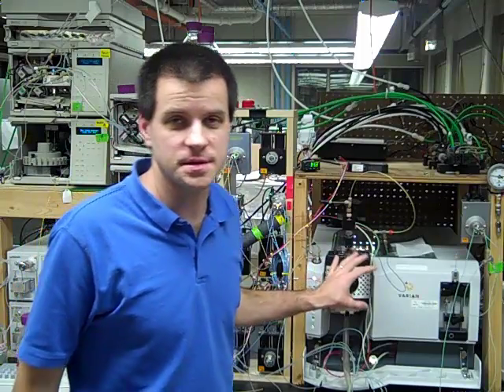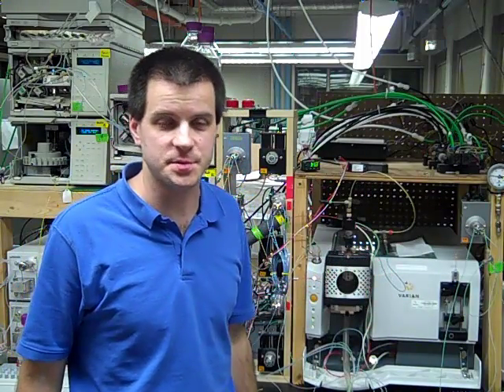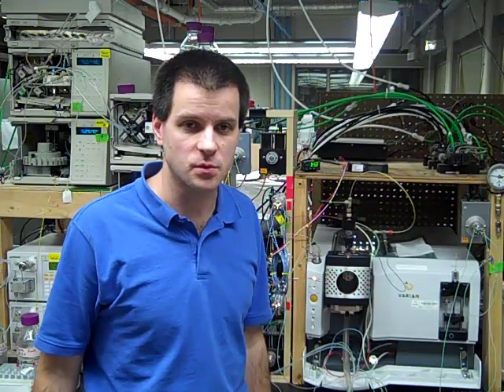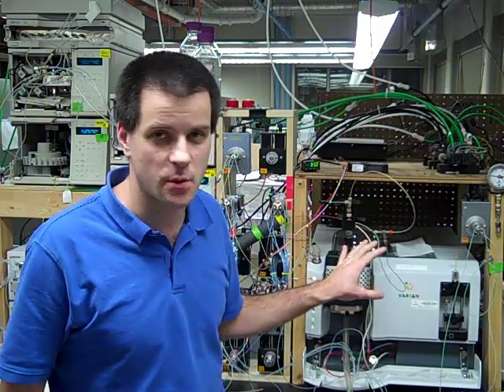This instrument here is one of our key pieces of instrumentation. It's called a mass spectrometer, which can be coupled to a liquid chromatograph. This particular instrument is what we call a triple quadrupole mass spectrometer, which is very useful for analysis of compounds at very low concentrations and in complex mixtures. This particular instrument is used primarily for student-faculty research, but we also use it in upper-level coursework as well.